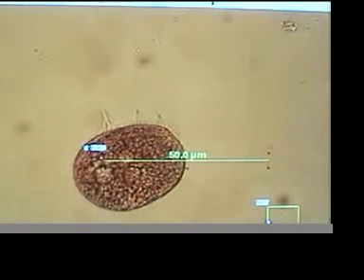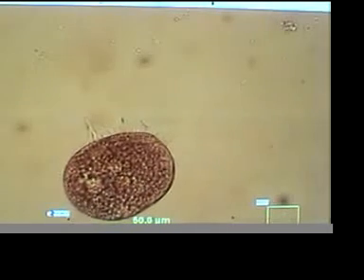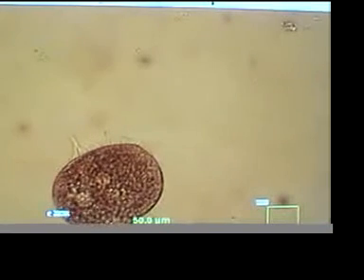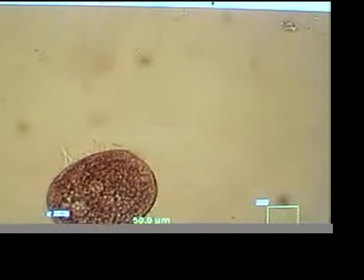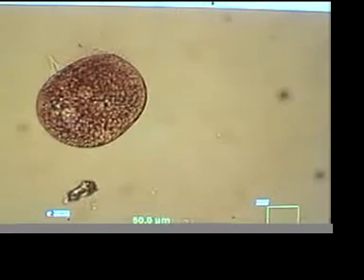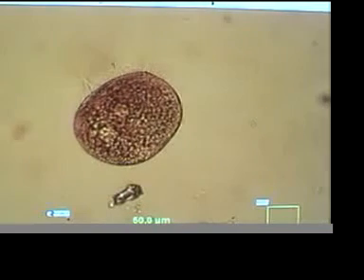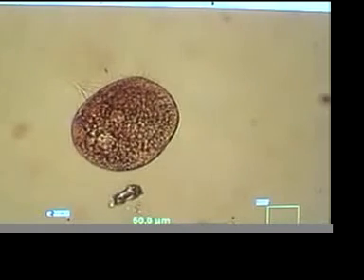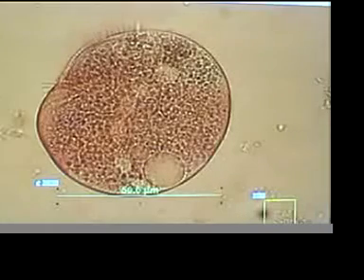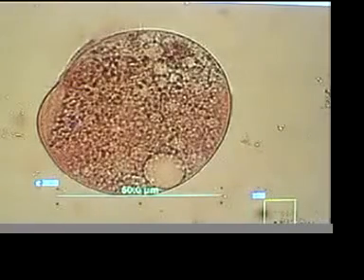July 6th, let me move that scale out of the way. A portion of the organism which normally has the cilia resealed itself. There it is, and it actually still has some kind of motive power here. But it's hard to believe because you didn't see the transformation. So if it makes any difference in this organism, I'm changing the focus just a little bit to see what we have.